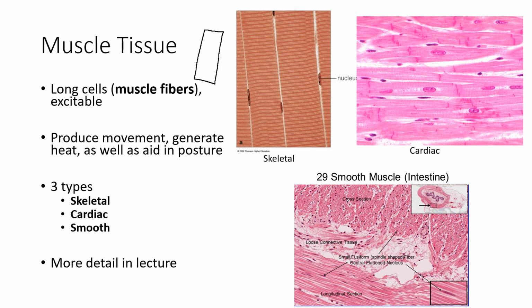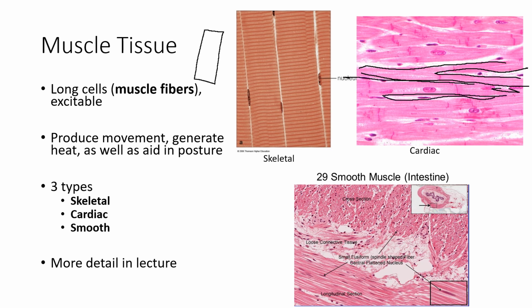So when we look at cardiac muscle, the cells are branched. So we can see a branching here as I trace it poorly, but there's one cell that's been branched. There's another cell. So we like to describe cardiac muscle as being a branched set of cells. And these cells in cardiac muscle are stapled together here. You can see these dark vertical bands.